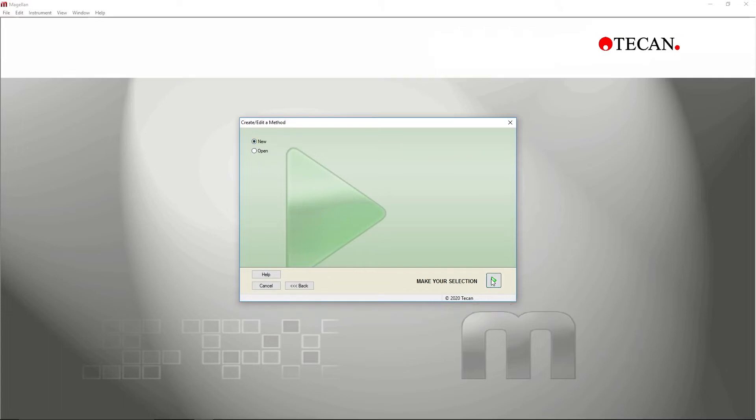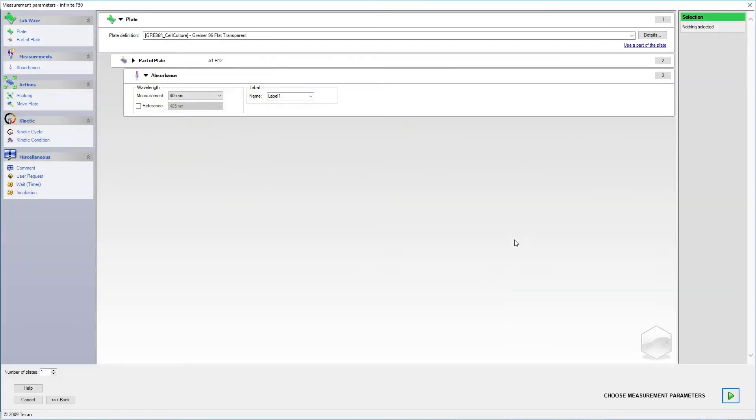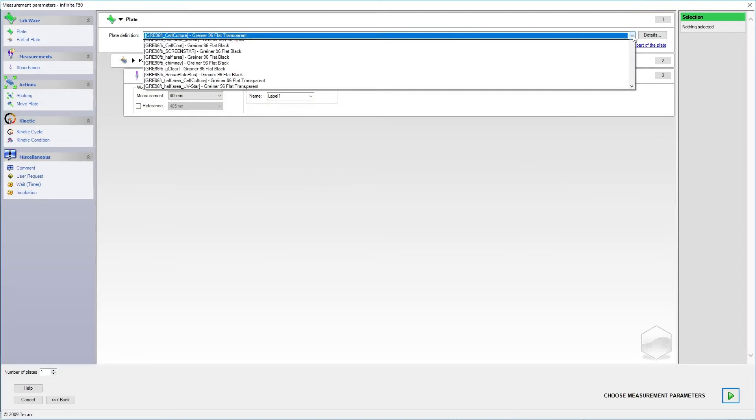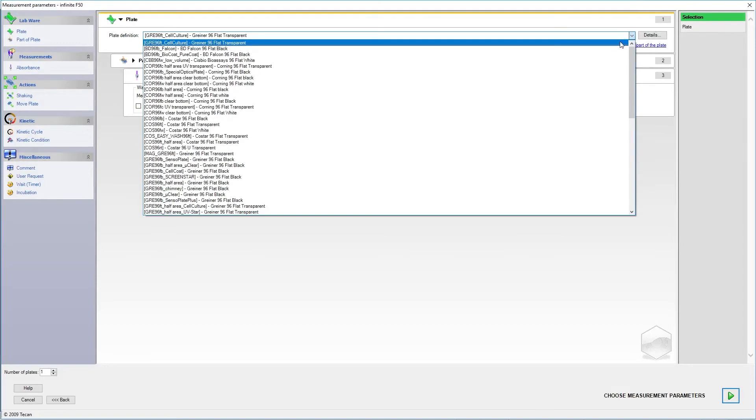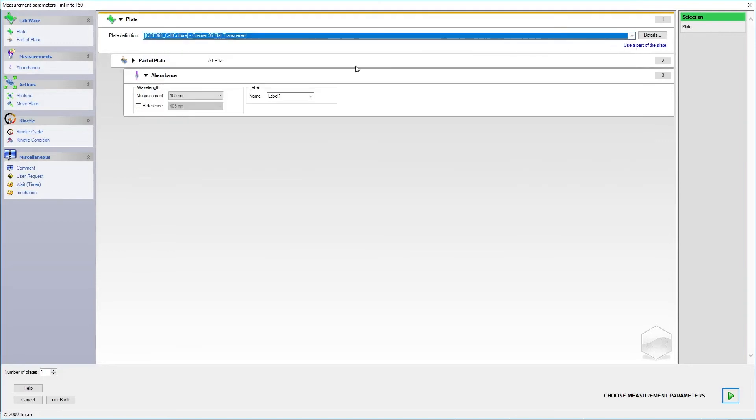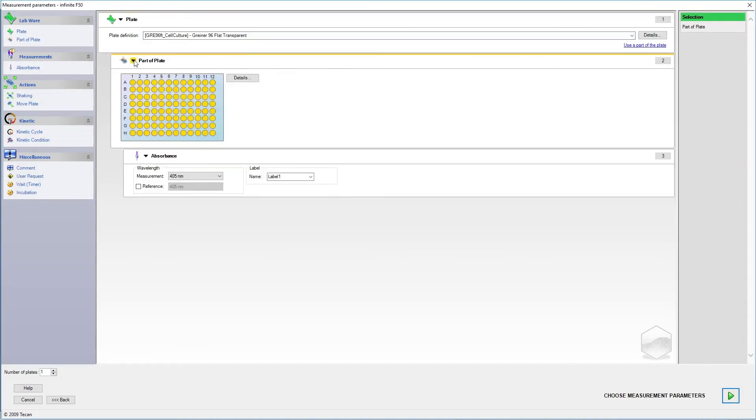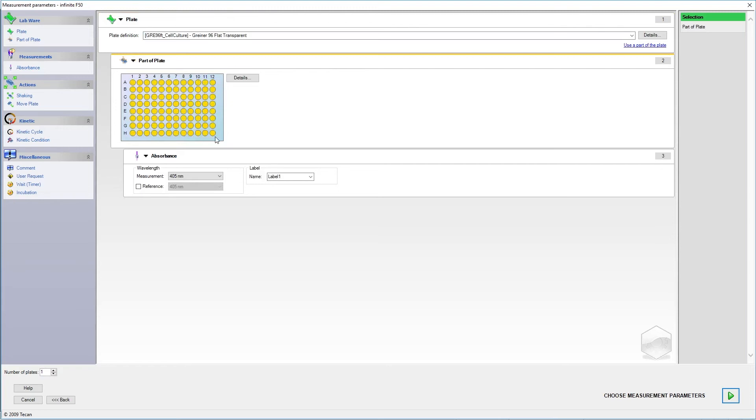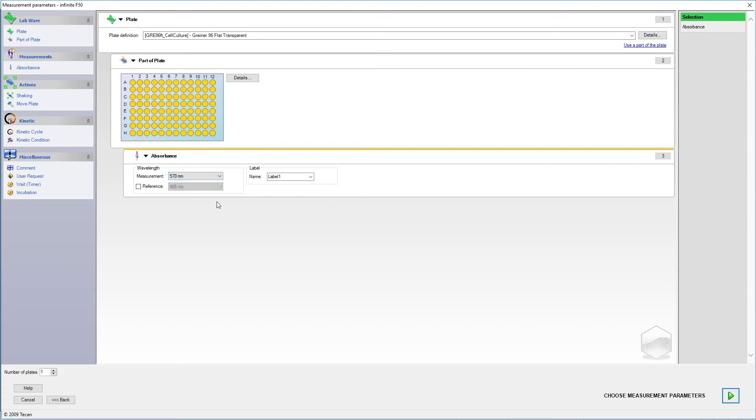First, we need to define the measurement parameters. Choose the correct plate definition for the plate you are using and the area you would like to measure. To perform an absorbance measurement, you can choose a measurement wavelength and reference wavelength if desired.